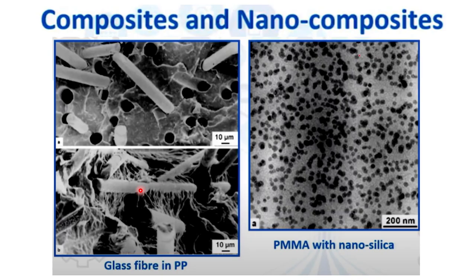But here this is the fiber, it is very strongly bonded with the matrix, but here it is not that strongly bonded. So obviously by checking the cross section of the fractured sample surface, you can modify it further to get better strength or better property.